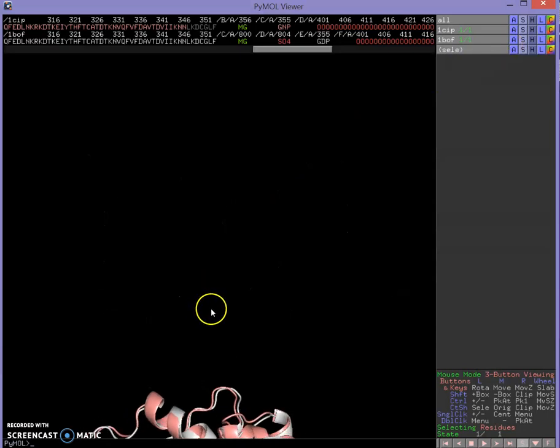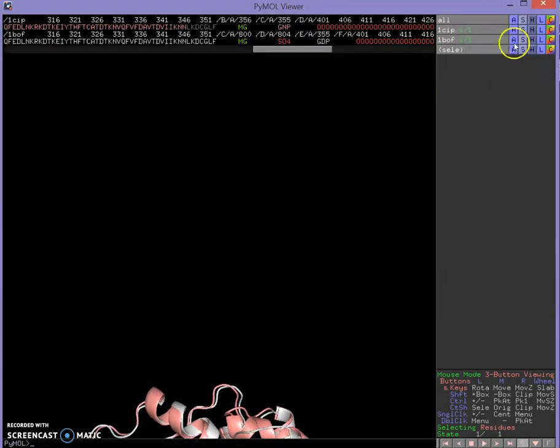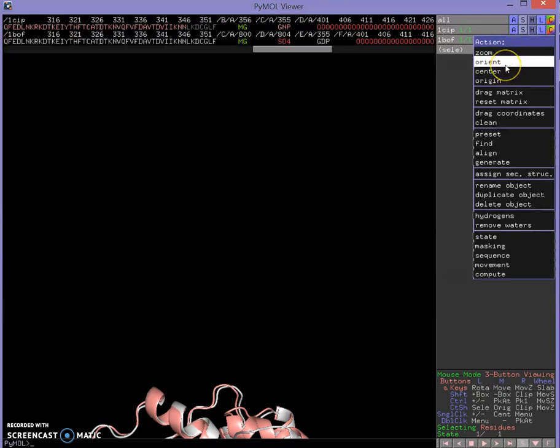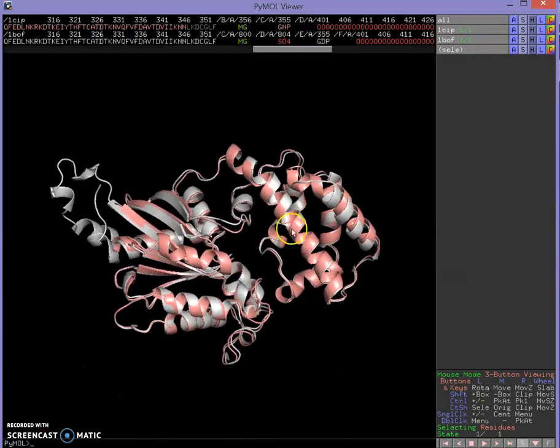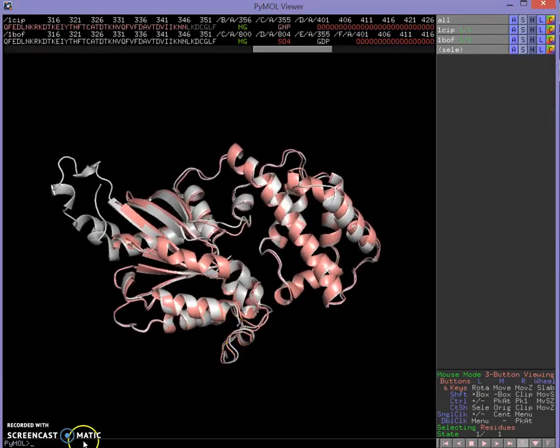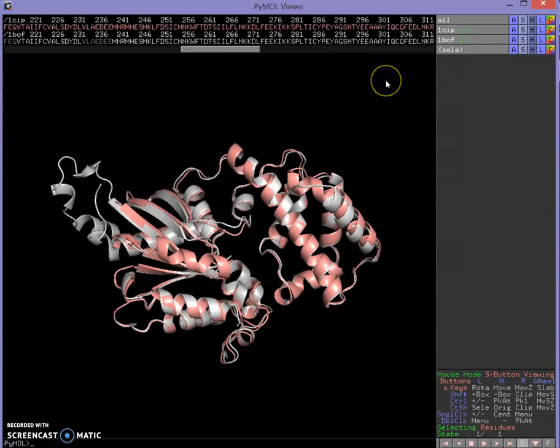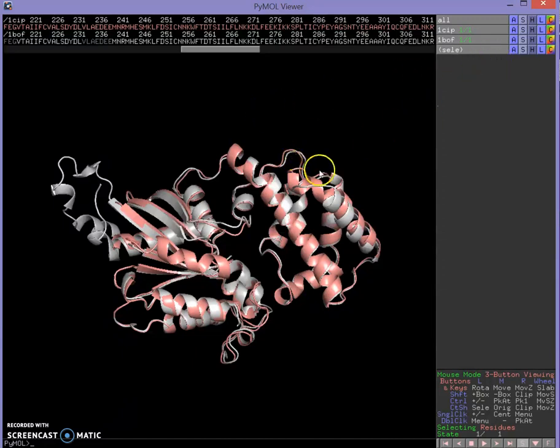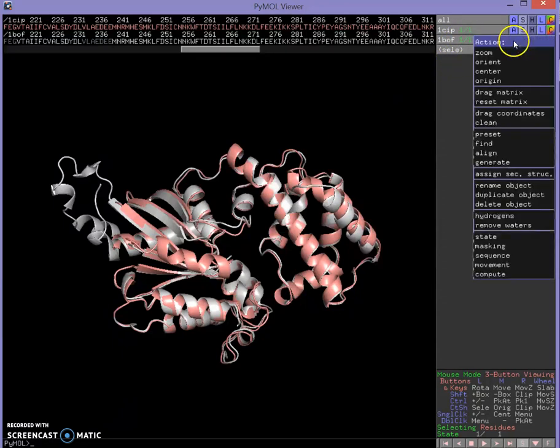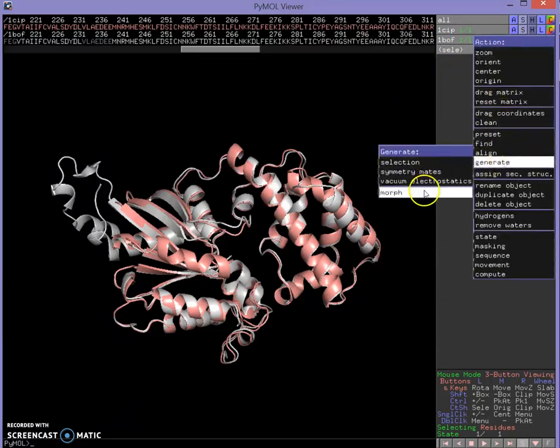Now I can go to Action and Orient on either one to bring it into view. I like to start from the GDP-bound form because it's the inactive form — that way we can show the mechanism of activation by switching to the GTP-bound form. So I'll go to my GDP-bound form 1BOF, go to Action, Generate Morph, to molecule 1CIP.